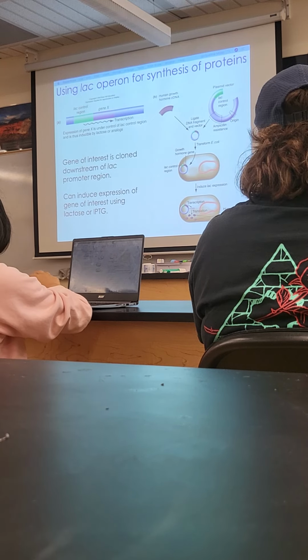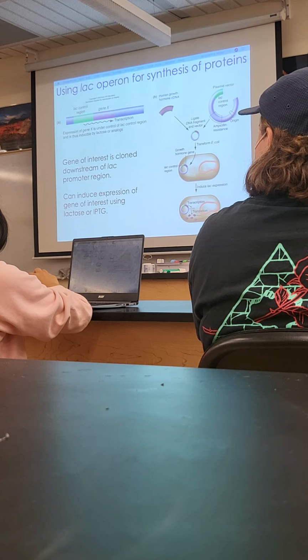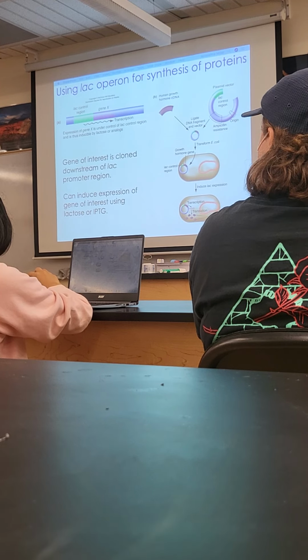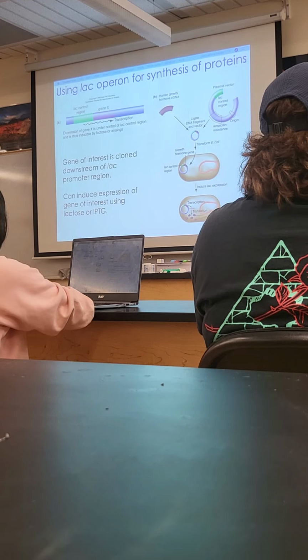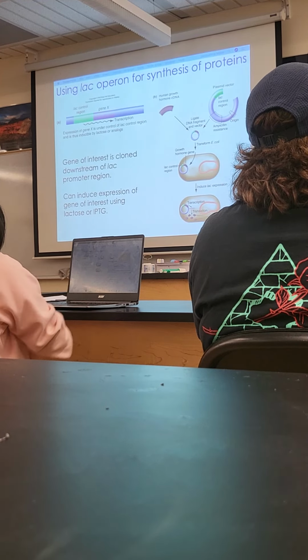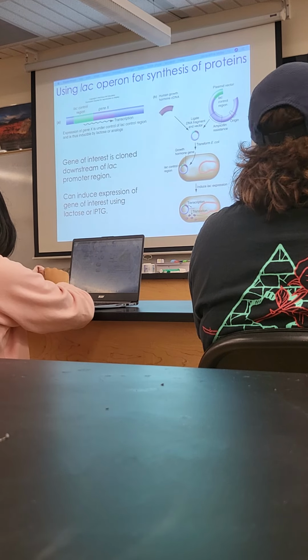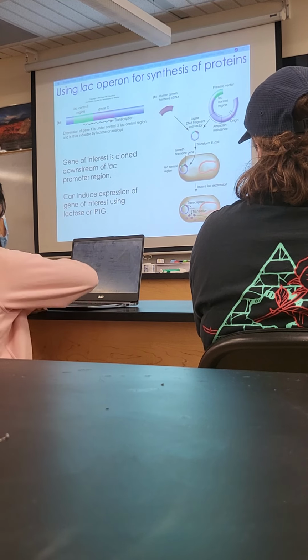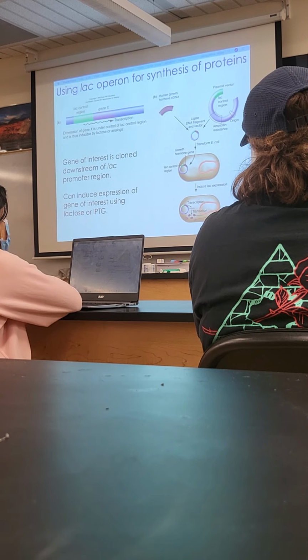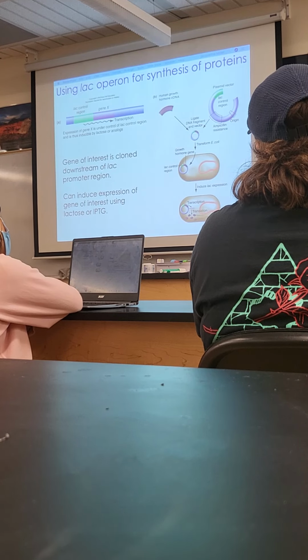So, to grow the E. coli, then you add the lac promoter so that the T7 polymerase gets produced and gets attached to the L4440 promoters. Then it goes. Does that make sense? Everything in our system is already in the bacteria. It's just a matter of when we add IPTG, then they'll start making the double-stranded RNA.